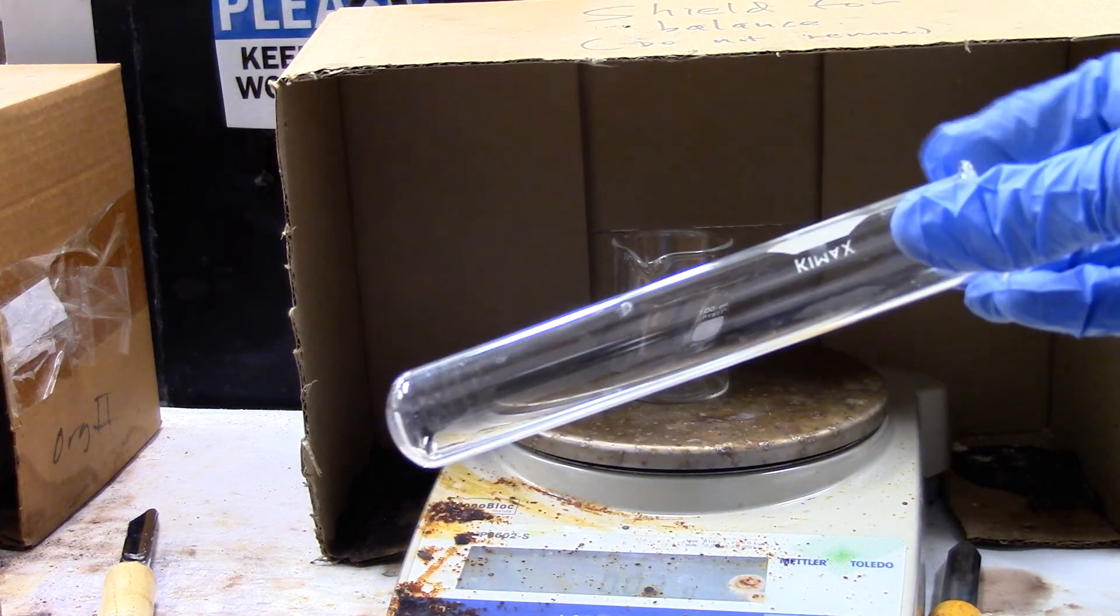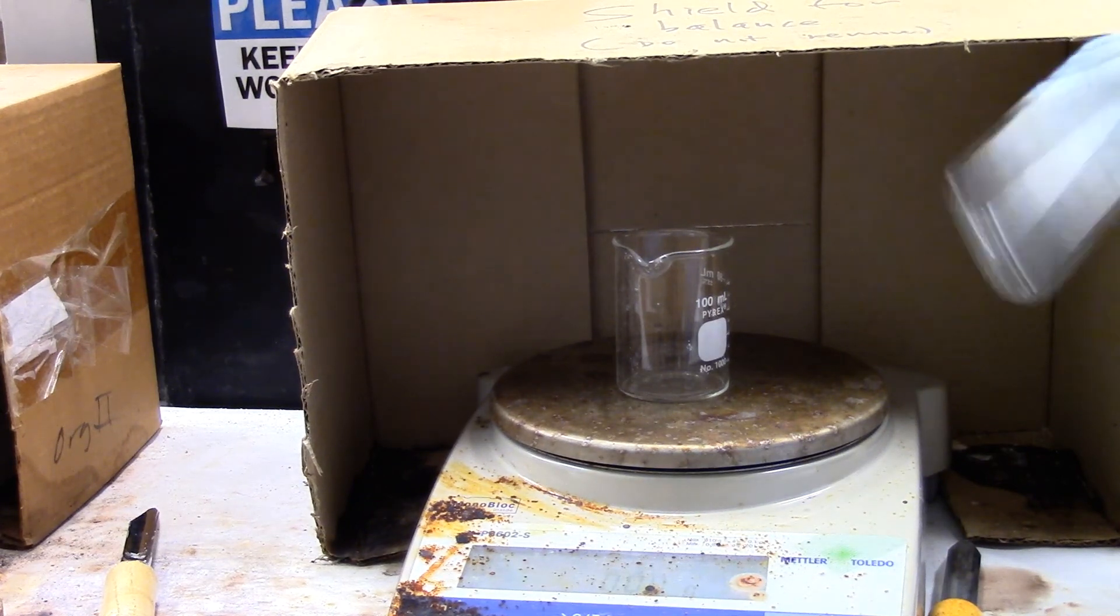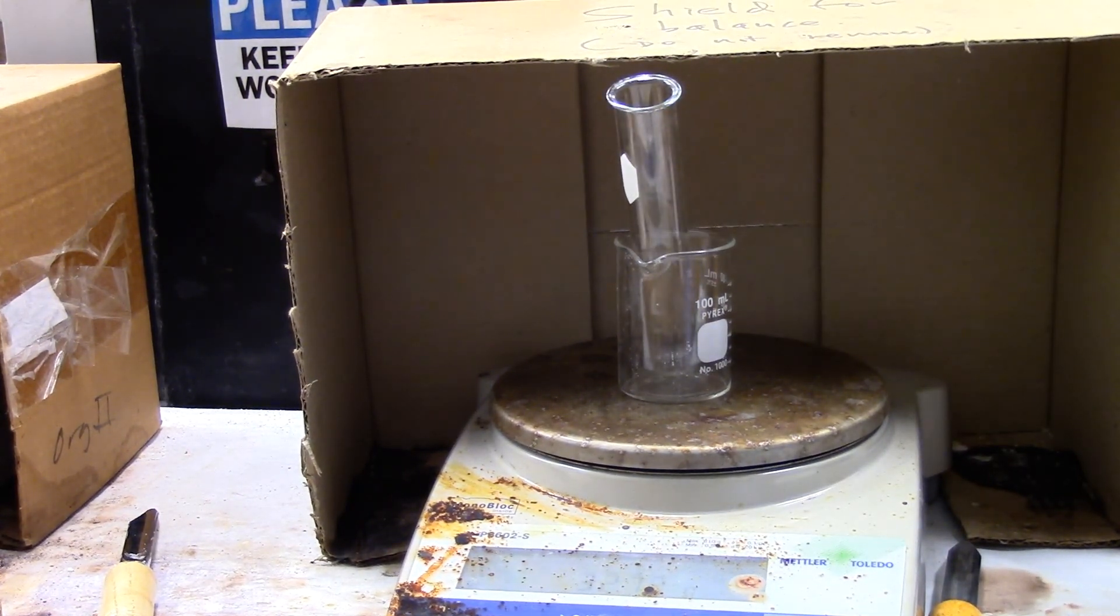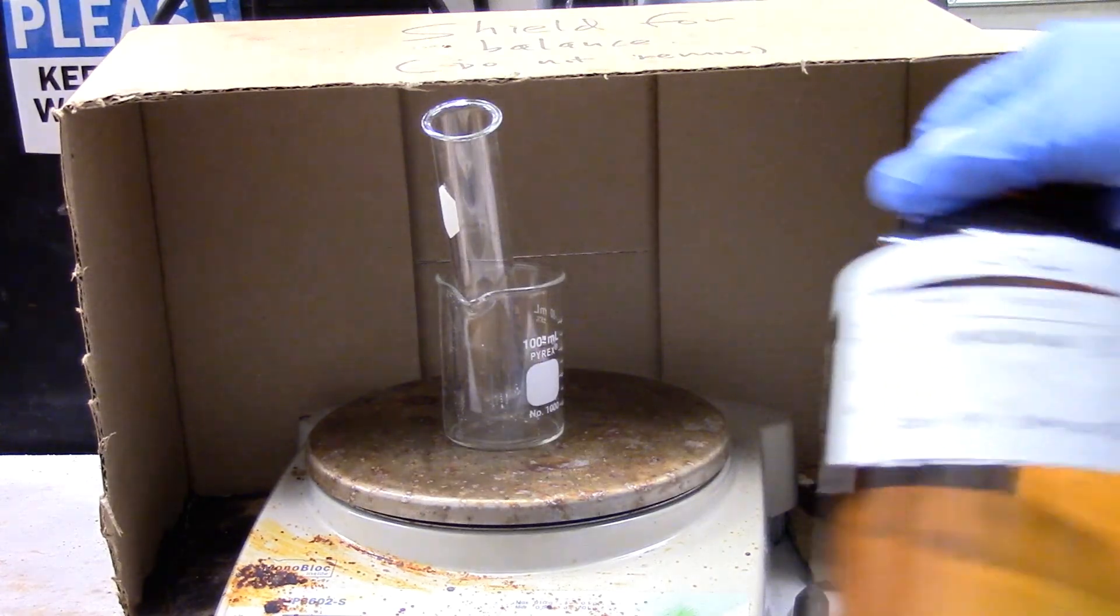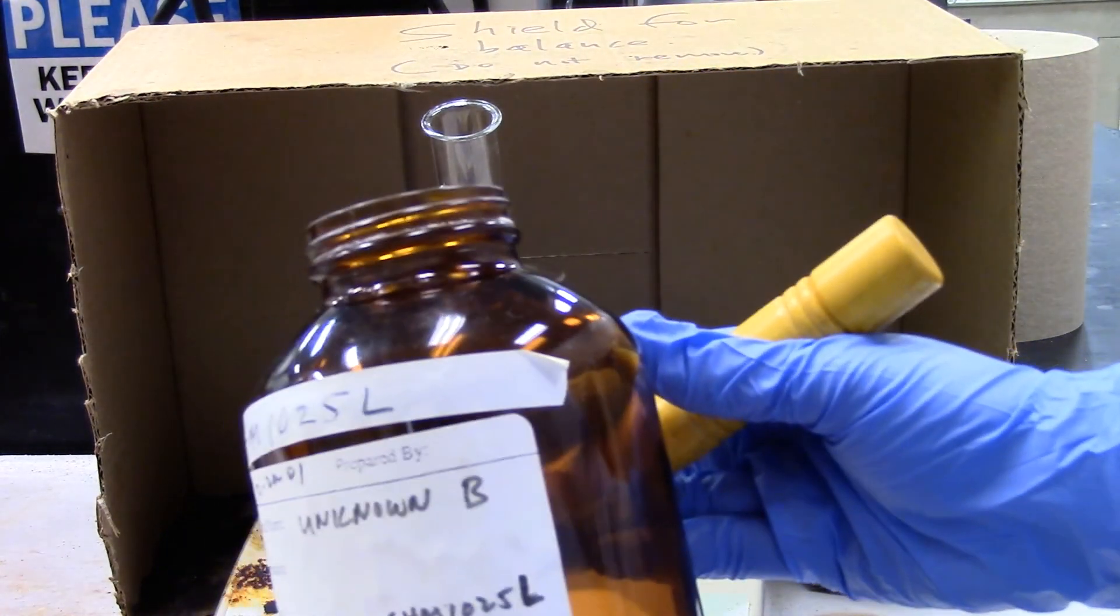So for the unknown, I'm going to measure the empty test tube. Tare the balance with the beaker, and then place the test tube in the beaker. I'm going to add some unknown. I'm using unknown B.